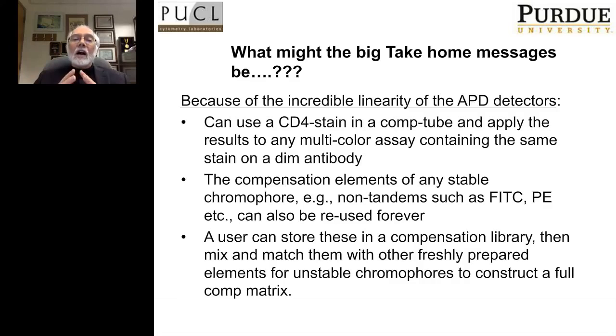And I think that may be unique, and it's not something that has been discussed very much. If this is true, then this changes the way we deal with compensation, because we may be able to take a compensation library and do mix and matching for all of the dyes that are run on a system. And that is something we don't consider in most flow cytometers.